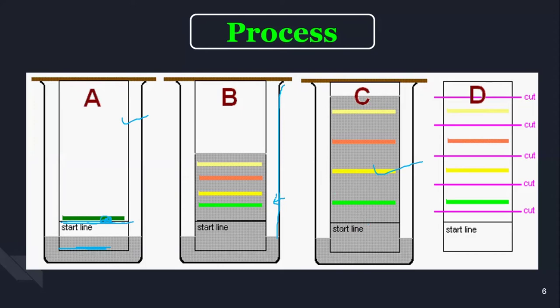So what will happen then, after hanging, the solution is going to start to flow from bottom to top with the help of capillary action. So over here what will happen, the chromatographic jar which is containing the solvent, but without dipping in the solvent, as earlier mentioned in this particular diagram. This actually helps to saturate the paper with solvent vapors, and now your strip is developed by running the solvent through the paper. Depending on the direction of flow we have the following types.